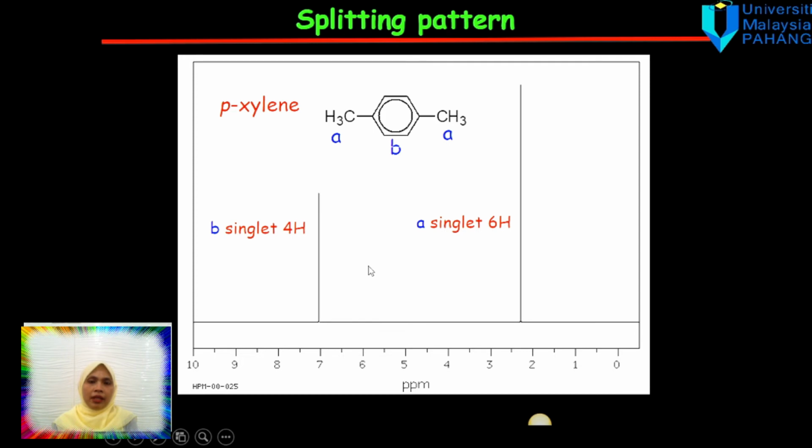Next example, they have 2 functional groups in this position, CH3 and this CH3 position. This means it is symmetrical on this side. In this case, they have 2 signals. This environment is the same for the methyl group, and all the protons in the benzene ring are the same signal with the 4 integration, 1, 2, 3, 4. And this methyl becomes a 6 integration. You can see the signal here is in the upfield, and this signal is downfield because it is an unsaturated signal.